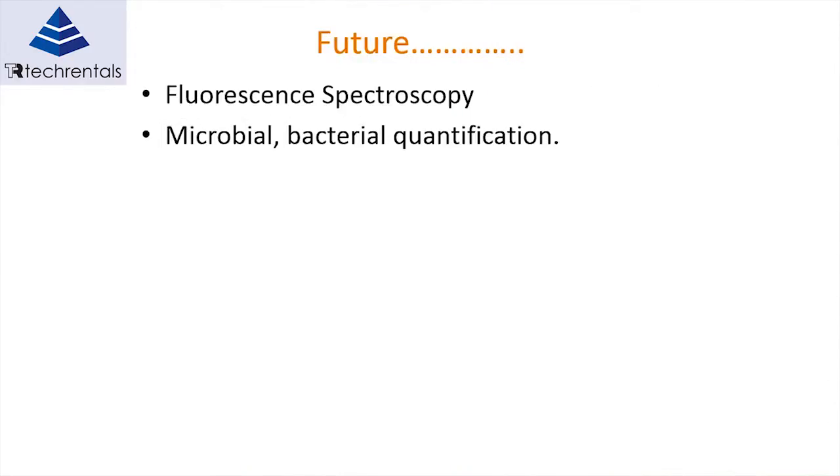Future analysis is a lot of research been done in fluorescence spectroscopy. It's been used for lab use at the moment, and also for microbial and bacterial quantification. That will be a big future development in infrared spectroscopy. So you'll see it in the lab first, and then transferring it to inline use will be quite a challenge, I would think.